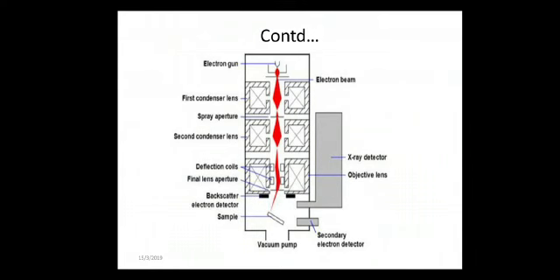The next disadvantage is, as I told in the advantage case, we require special training for the operator. Only then can we get clear or magnified images, or else it is very difficult to get the images. Maintenance is also high compared to other machines, like optical microscopy or some other devices. The maintenance cost is high in the case of scanning electron microscopes, and it involves keeping a steady voltage and current through the electromagnetic coils and circulation of cool water.